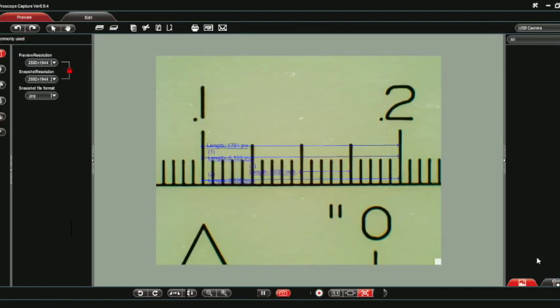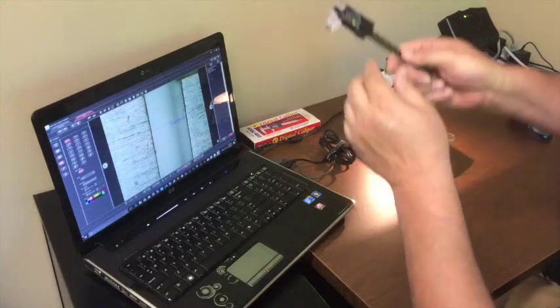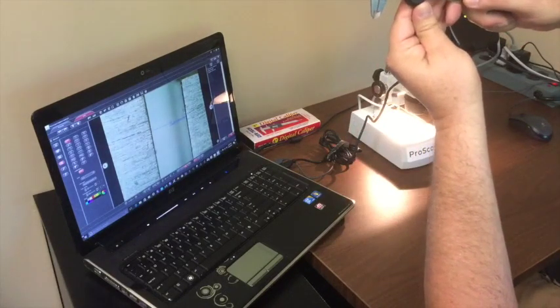Now I'm looking at the gap of the calipers set to fifty-four thousandths. I'll take a picture of that and double-click the thumbnail to bring it up. Since I'm still calibrated to the reticle, I'll choose a measurement line and draw a line from this edge to this edge. That distance verifies that we are in calibration — even though I had to change focus, the calibration is still accurate. It measures fifty-four thousandths of an inch, and the calipers confirm fifty-four thousandths.